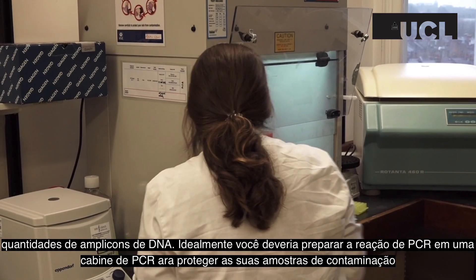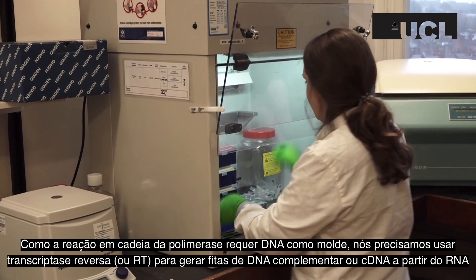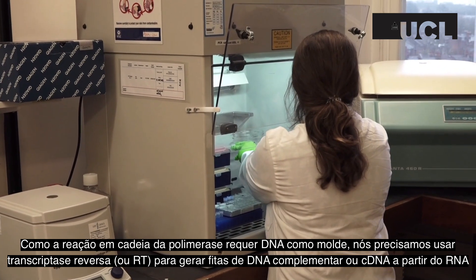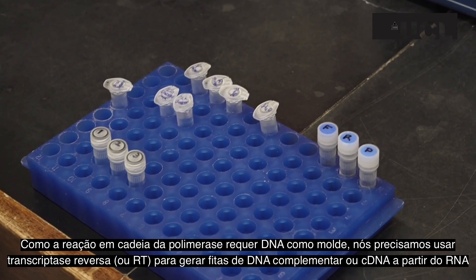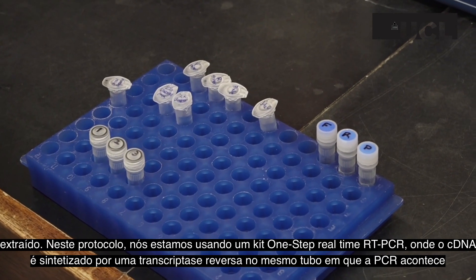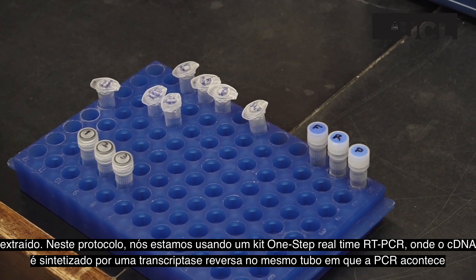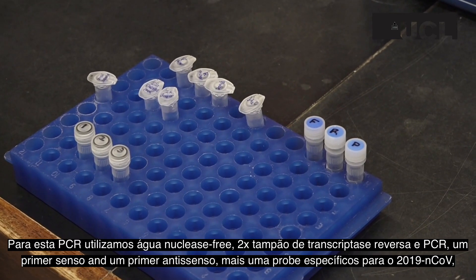Ideally, you should prepare your PCR reagents in a cabinet to protect them from contamination. As the polymerase chain reaction requires DNA, we need to use reverse transcriptase, or RT, to create complementary cDNA strands from the extracted RNA. In this protocol, we are using one-step real-time RT-PCR, where the cDNA is synthesized by a reverse transcriptase in the same tube as the PCR reaction.